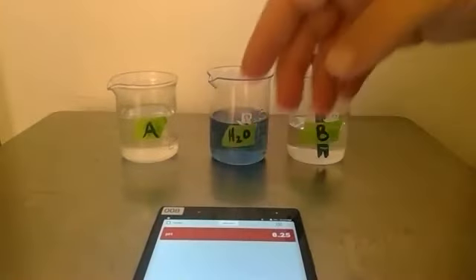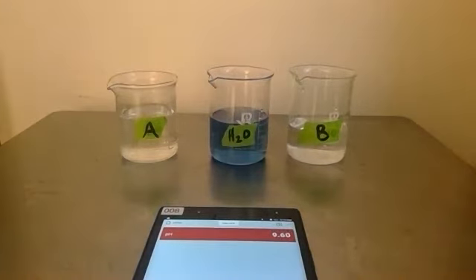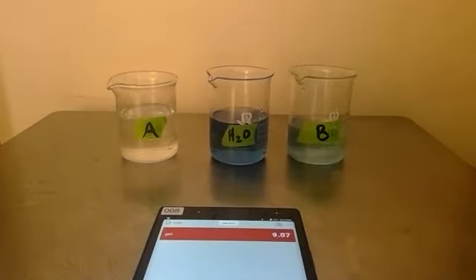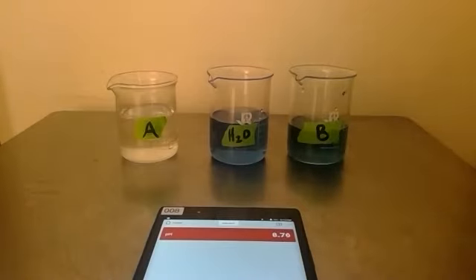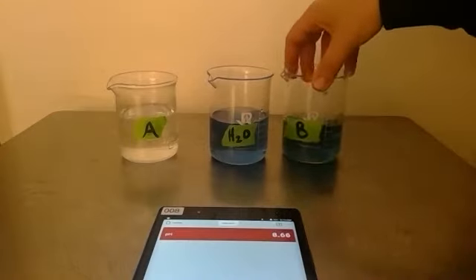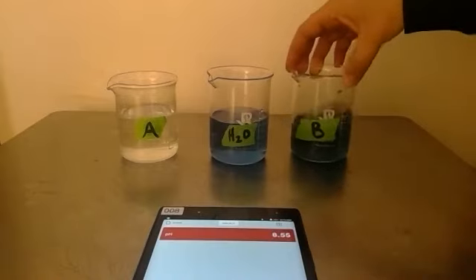This is a higher pH. Let's find out what happens when we add our indicator for a visual cue of its basicity. Again, this is a pretty purplish color and I'm adding it in. It's blue similar to the water but it's much greener, and I'm hoping that color comes through on our video. It's a lighter greener color but it definitely has some blue to it. There's our base.